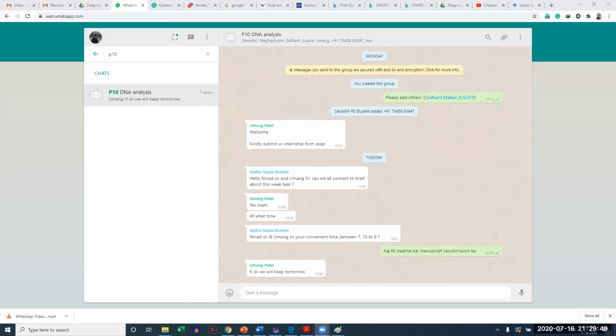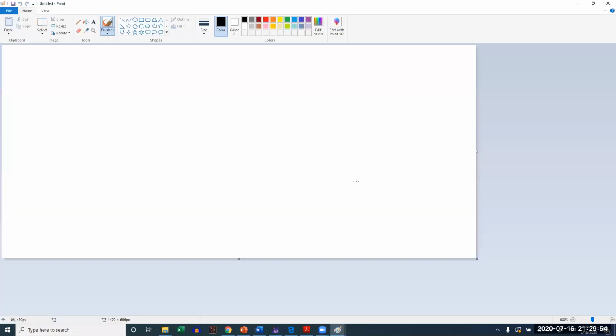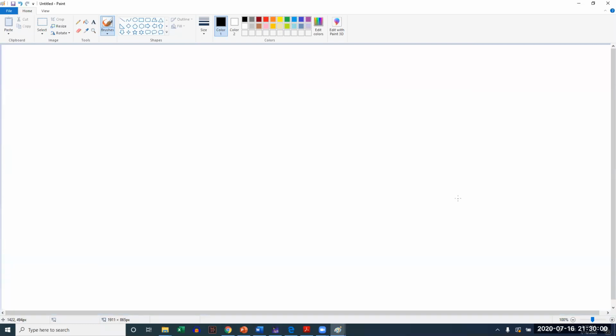Okay. Hello, everyone. So this is a project explanation for DNA analysis using image processing, and we are going to use something like gel electrophoresis images. Now, basically, DNA is unique for multiple people, and you can find out whom you are genetically related with, like your father, mother, grandparents, and so on. So this has multiple applications.